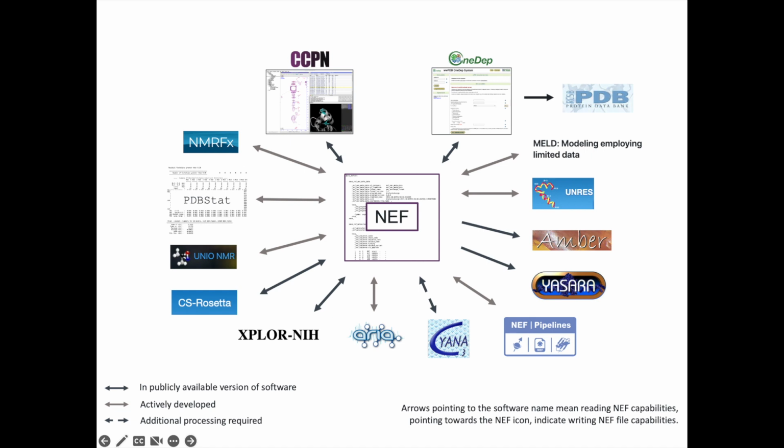Now lots of work has been going on in the years in the meantime to try and get this working and make programs compatible. You can see that a number of different programs are already working nicely. So CCPN, for instance, CS Rosetta, XPLOR-NIH, Amber and Yasara can both read NEF even though they don't write it, and also the PDB is accepting depositions in NEF format.